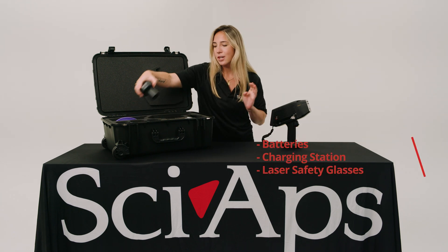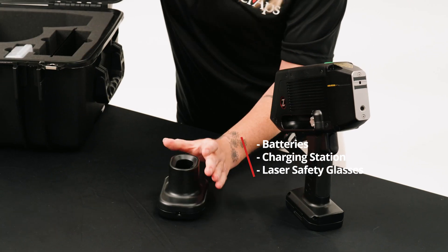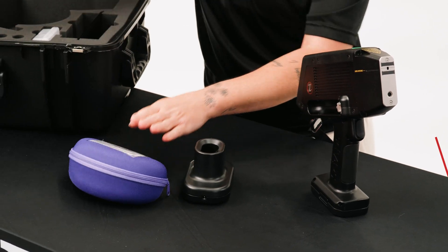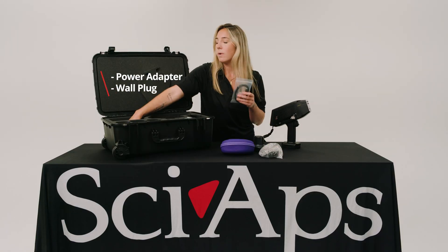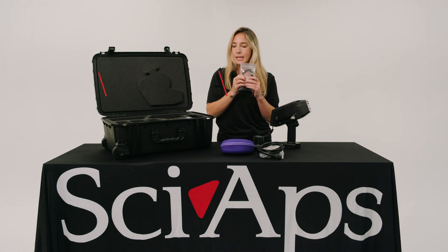Also included is a charger and an extra battery just in case. Laser safety glasses — you definitely need these, highly recommend. You have your wall adapter, your wall plug, and your kit.